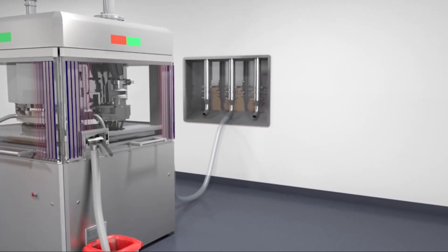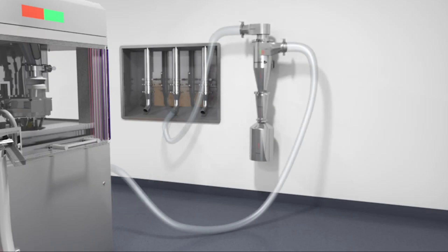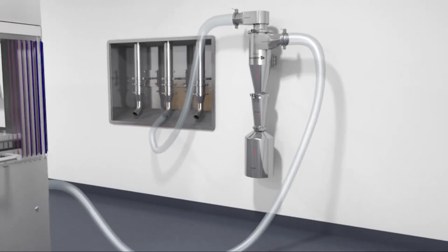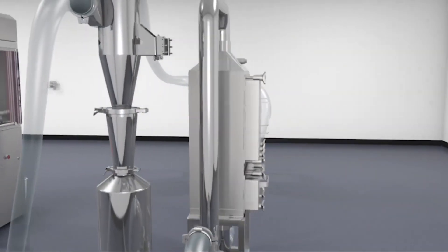Hanningfield have engineered a solution to these common problems: the Unidust High Efficiency Filterless Powder Recovery Cyclone. The cyclone is designed to be fitted or retrofitted between the process machine and the local exhaust ventilation line inside the process room.